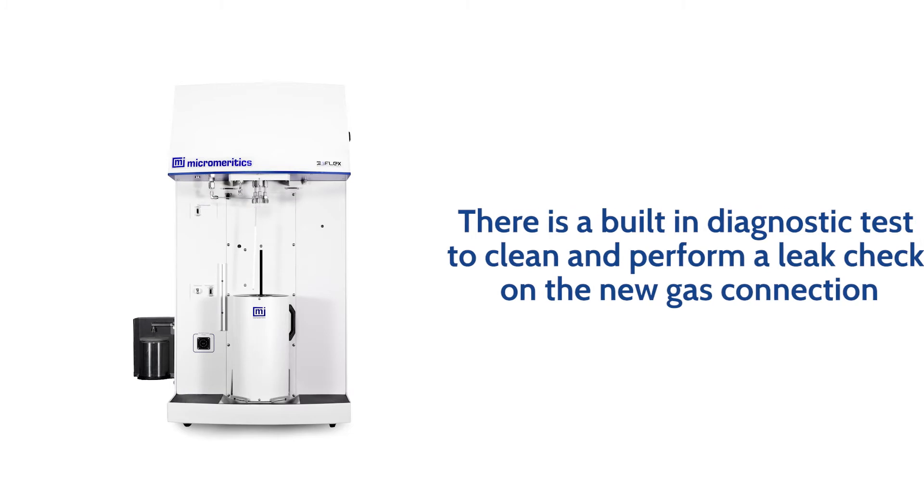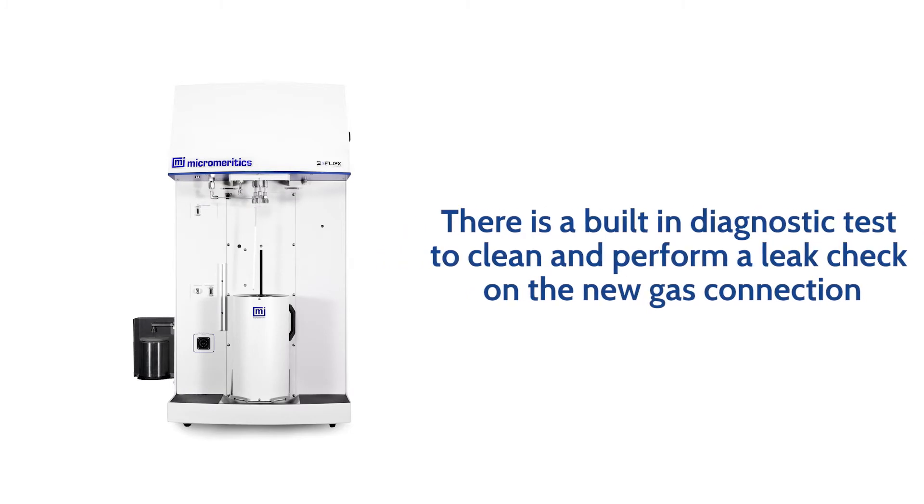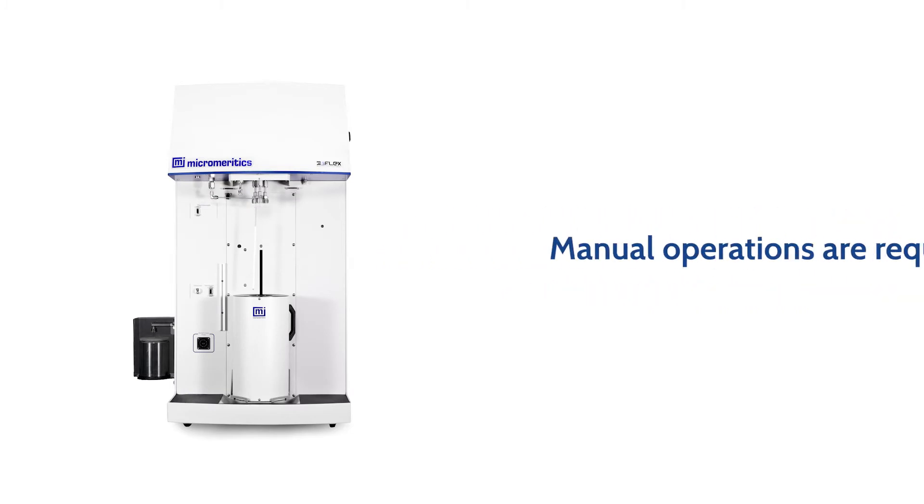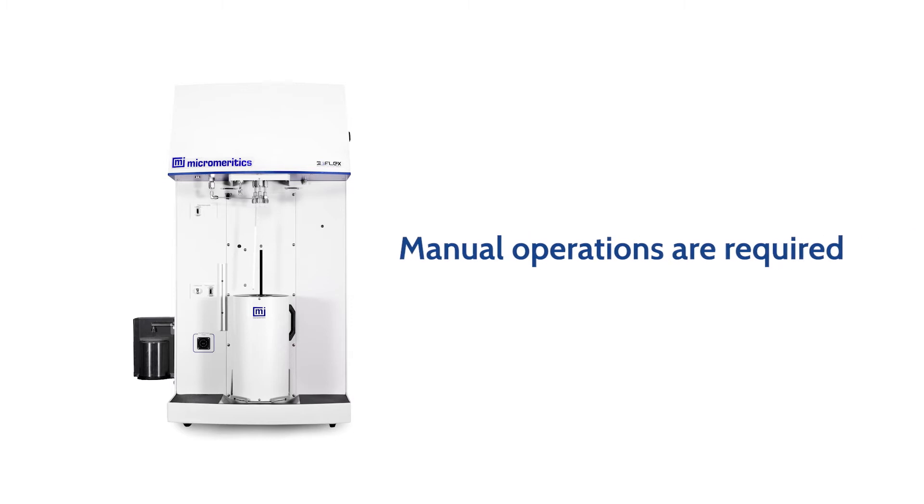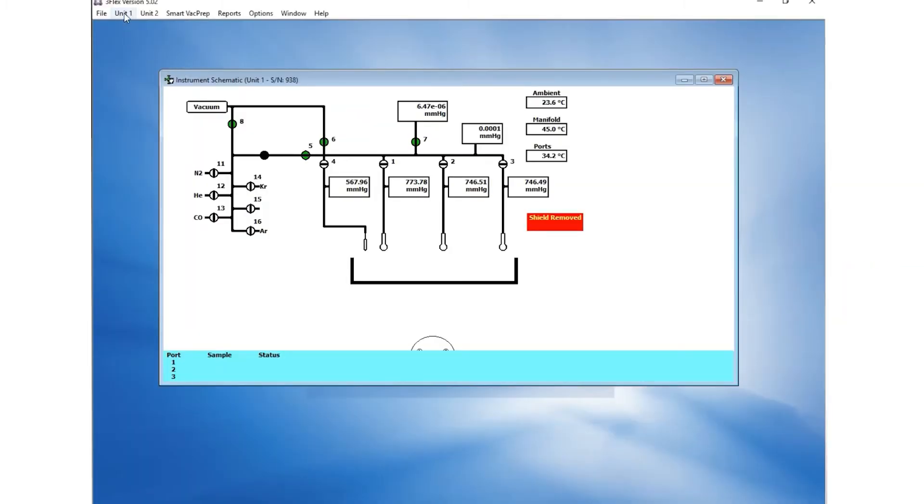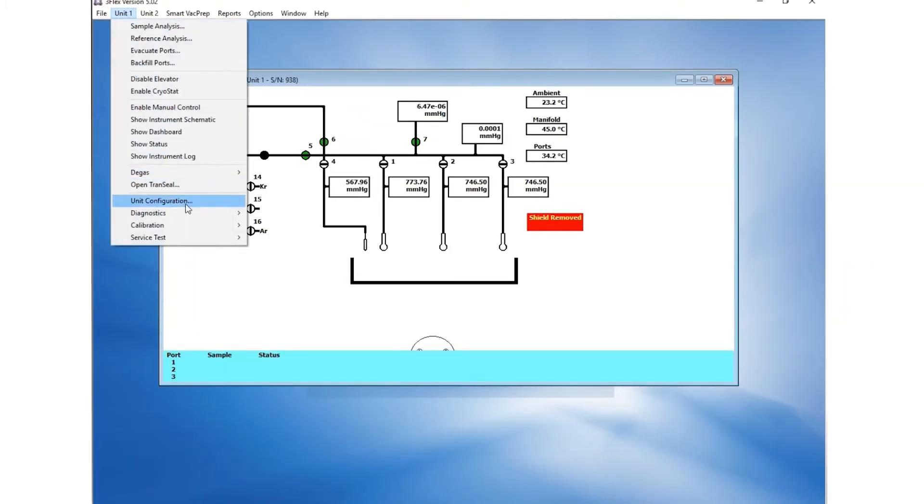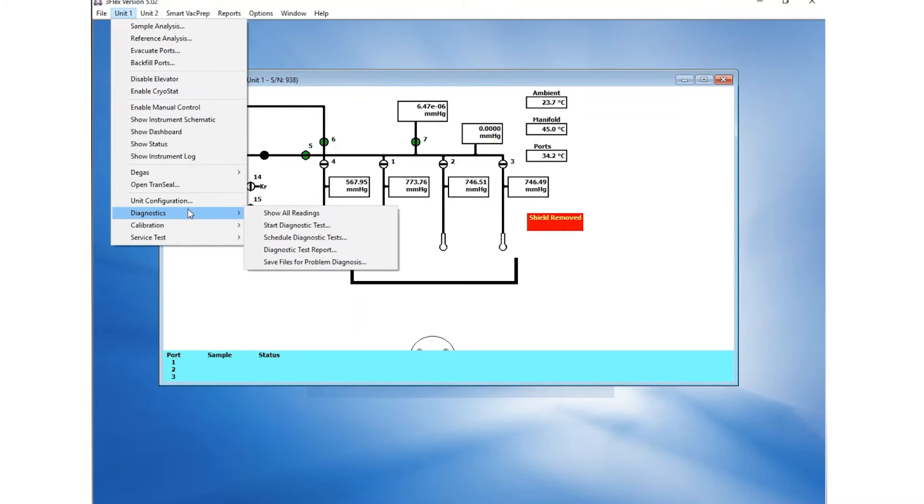There is a built-in diagnostic test to clean and perform a leak check on a new gas connection. Manual operations are required and users will be prompted by the instrument with on-screen instructions. In the software, go to Unit, Diagnostics, Start Diagnostics Test.